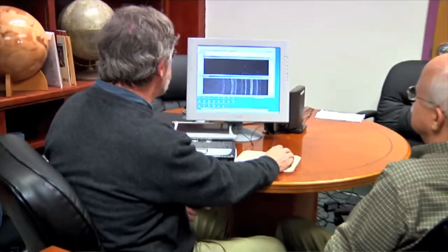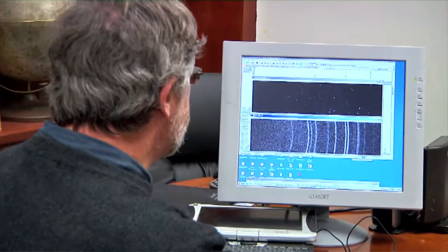So if you compare the two patterns, one is being shaken and the other is not, you can see there's just a huge difference in what it looks like. And it actually flows like a liquid. If you look in there, it actually looks like little eddies. So instead of using your hand, you're using sound waves. Exactly right. To do the shaking. Exactly that, right. That's the key insight. Here and create these three peaks and so forth.